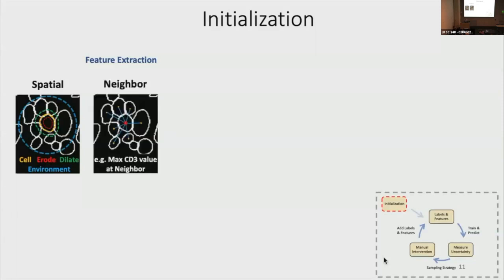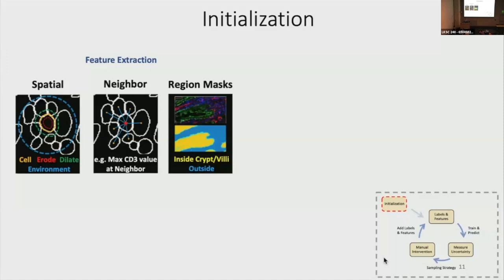And then we looked at, for each cell, its neighbors, and what was the maximum expression of a neighbor. And this helped us to capture these spillover effects where we had really high expression of a neighbor and a low expression on the self. And it's flexible to kind of use anything you want to put into it.